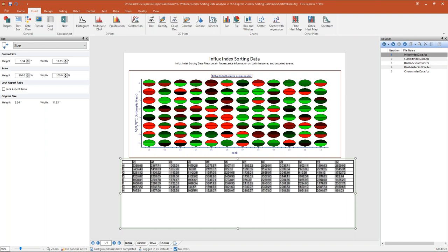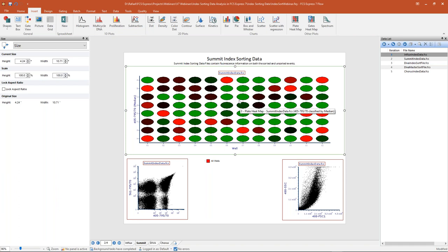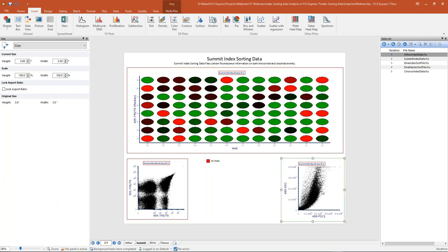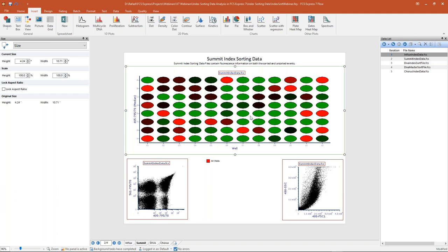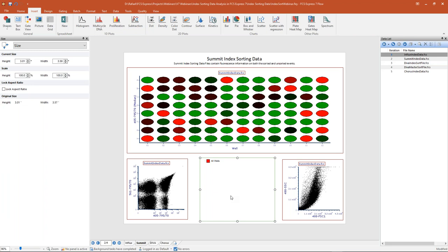Let's move on to our next example using Summit data. Summit data behaves identically to the Influx data — the Summit index sorting data files contain information on both the sorted and unsorted events. On this page I already have inserted my plate heat map along with my two color dot plots. The heat map has been formatted with a different standard deviation for better color separation. We're going to delete the previous gate and start anew with our Summit data.